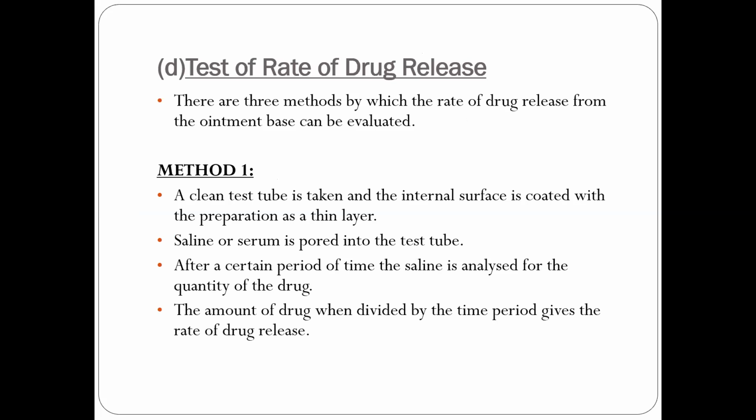Then the next test is the test for rate of drug release. There are 3 methods by which the rate of drug release from the ointment base can be evaluated.